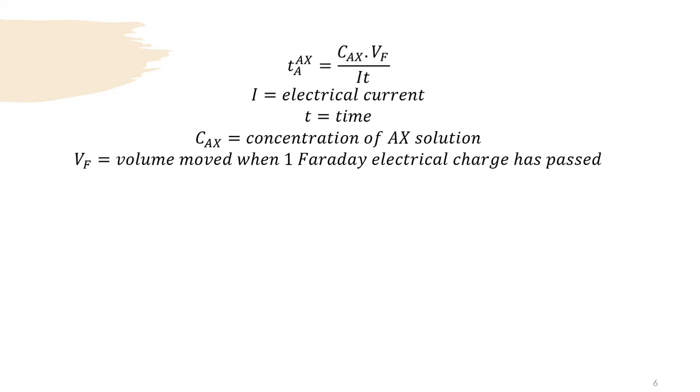You have to measure how much volume it takes to go from one graduated line to another, and once you have decided what the volume is, then you can safely proceed. The electrolysis cell is not bought but made by the glass blower, so the size may be a little bit off from one cell to another. So this has to be taken into account.